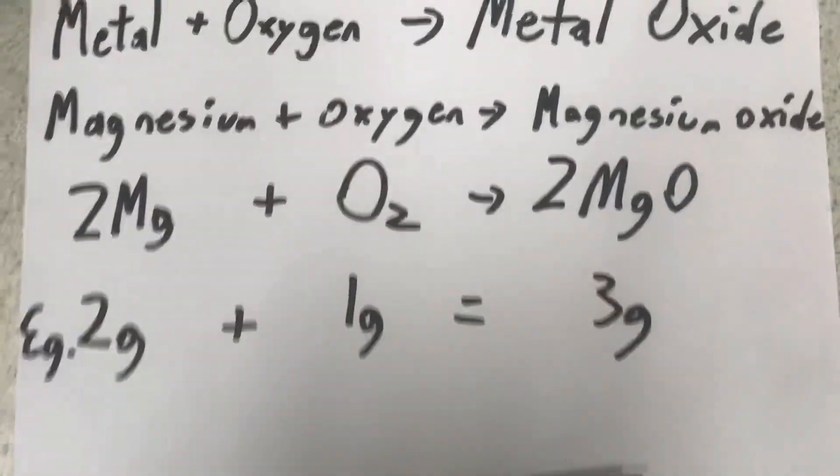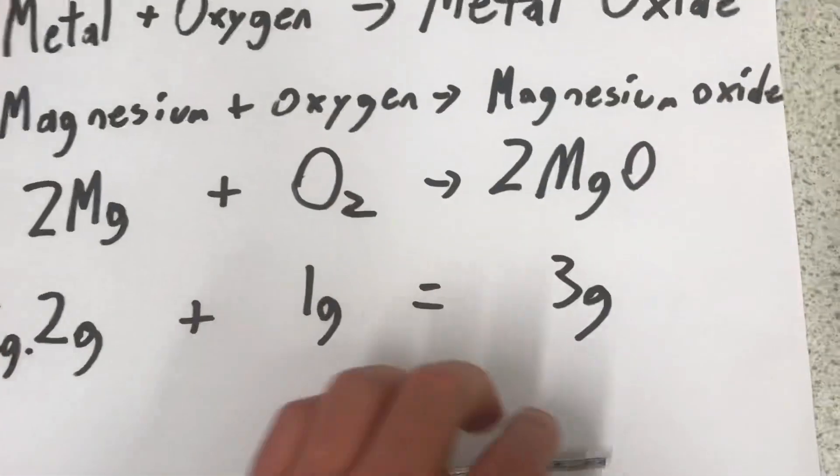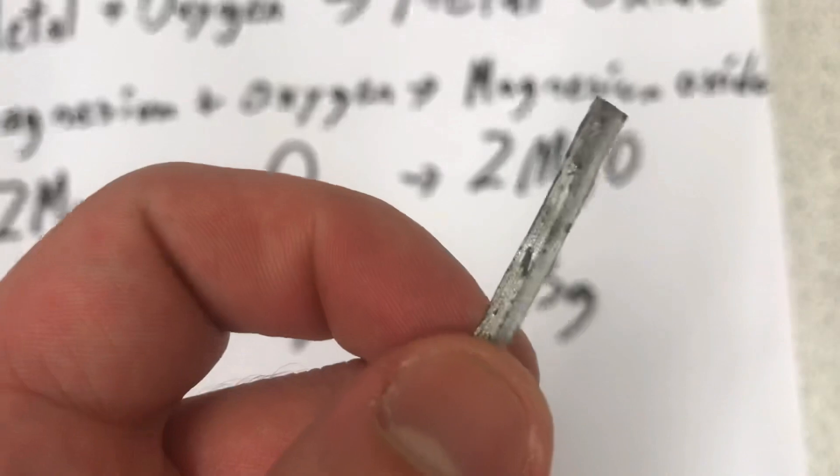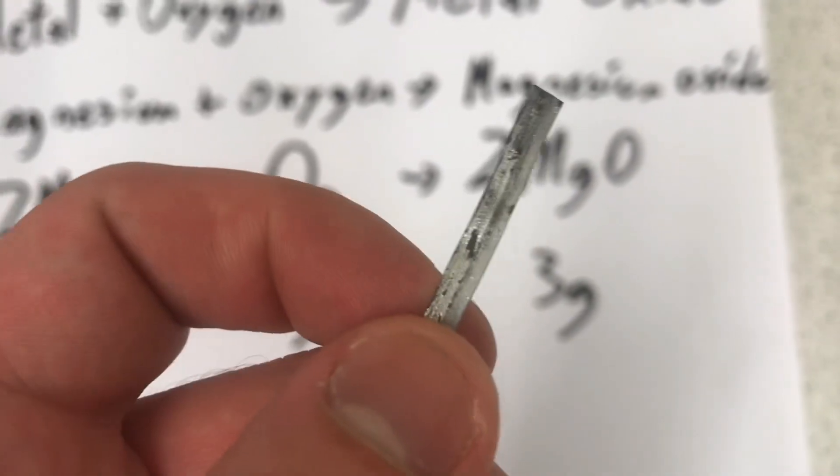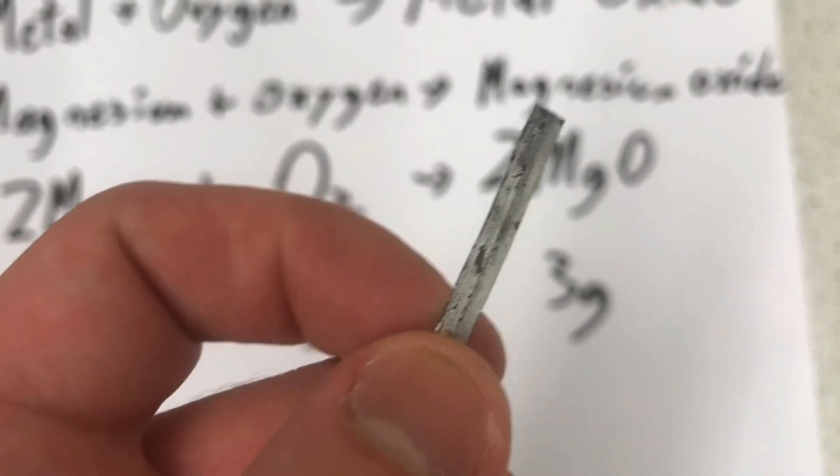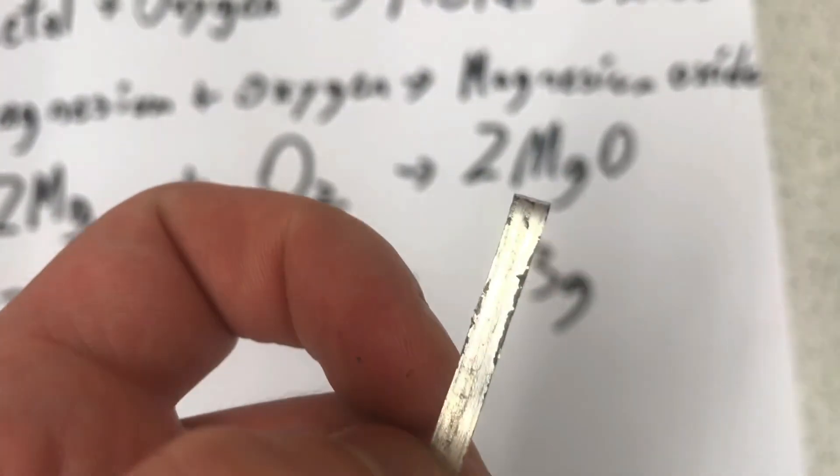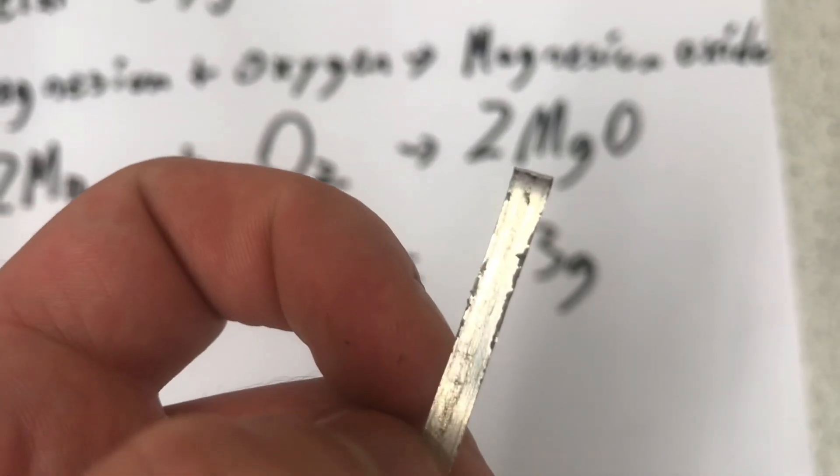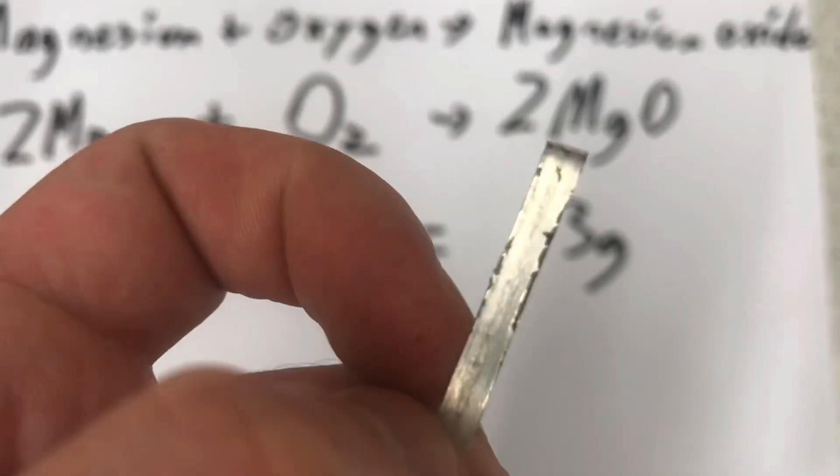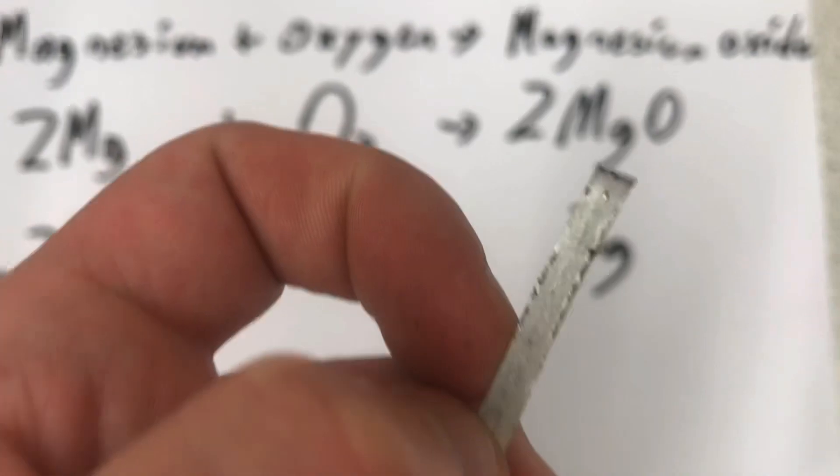Now, magnesium oxidizes in the air to form a black layer of magnesium oxide on the metal that you can see here. The part that's dull is magnesium oxide. So, I've used emery paper to shine this magnesium to make it very lustrous. That's the scientific word for shiny, so that it has no oxide on it at all.